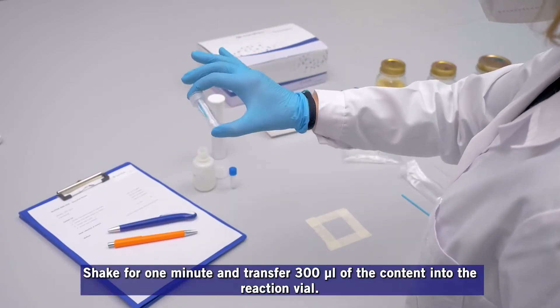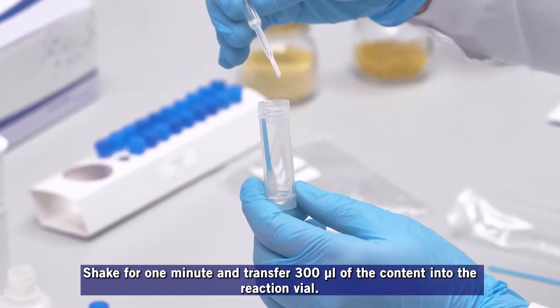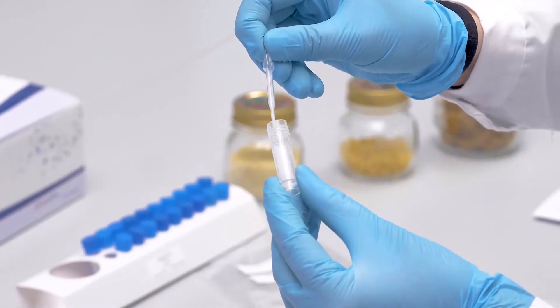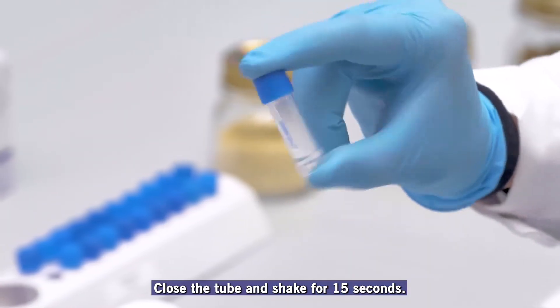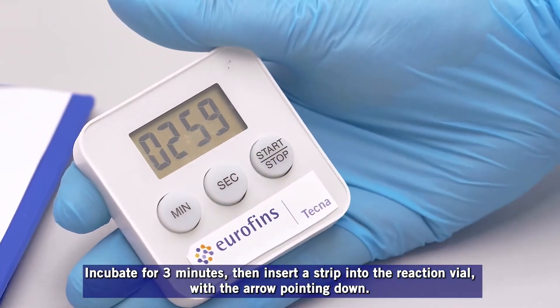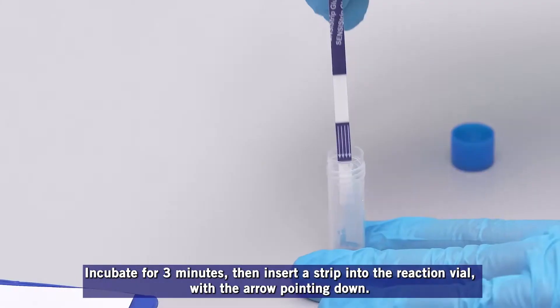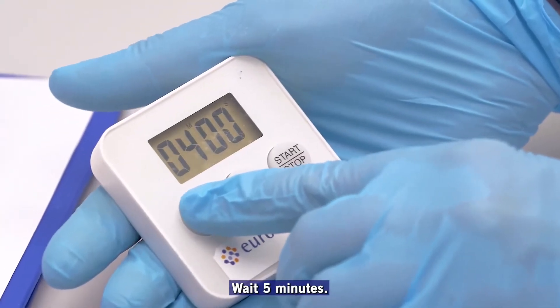Shake for one minute and transfer 300 microliters of the content into the reaction vial. Close the tube and shake for 15 seconds. Incubate for 3 minutes. Then insert a strip into the reaction vial with the arrow pointing down. Wait 5 minutes.